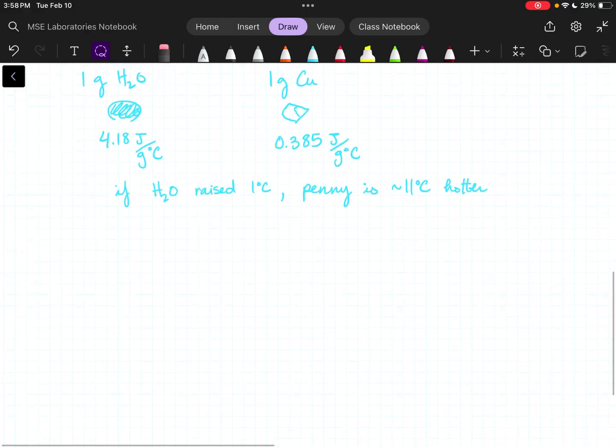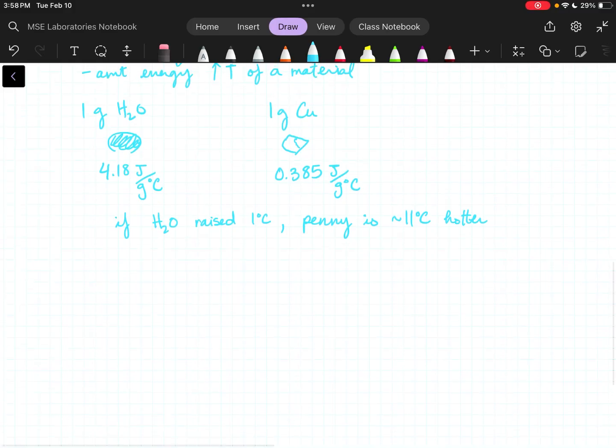Okay. There's a whole bunch of different units. This one I have energy per gram degree Celsius. I could just swap in degree Fahrenheit if I was a lunatic, or Kelvin. So we can change that unit to be increased by 1 Kelvin. It's not a degree, 1 unit Kelvin. I could use, instead of grams, per mole of the material. Or I could say per pound of the material, again, if I'm a lunatic. So I can change those units. I think joule is pretty much always the unit, but there are other energy units as well, and joule is not necessarily the only unit.